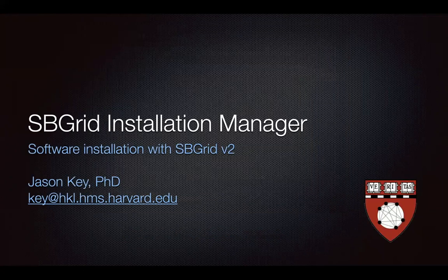So today I'm going to tell you about our new SBGrid installation manager. This is software that we've developed in-house to install the SBGrid software stack.